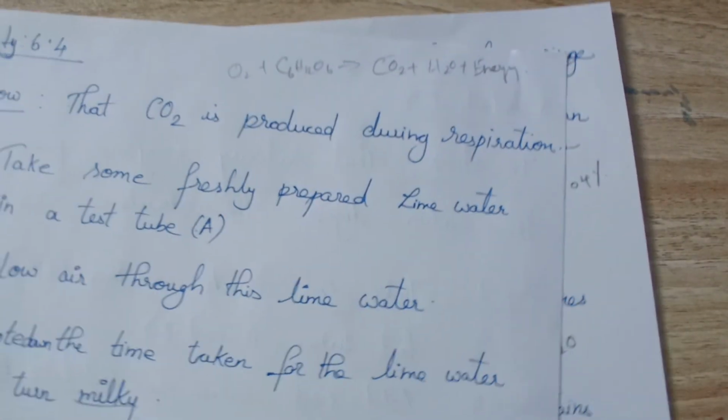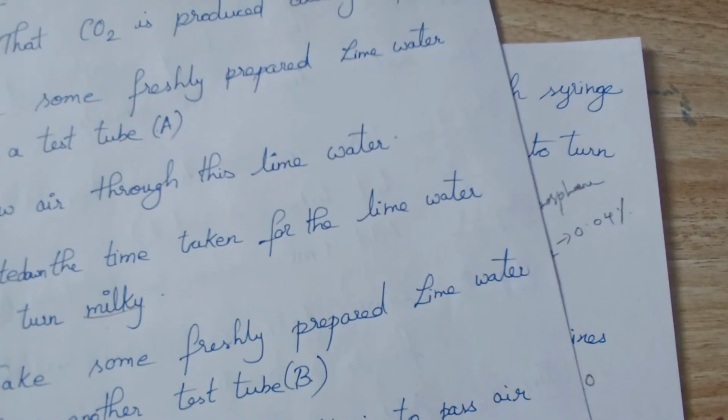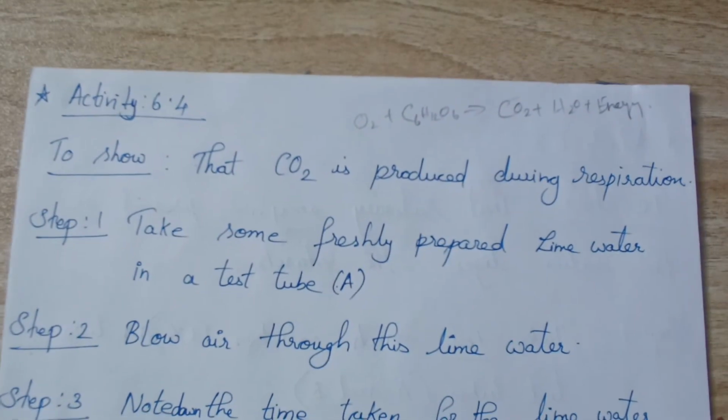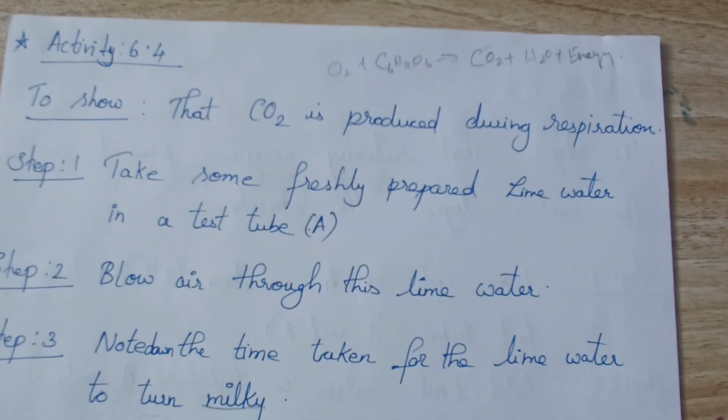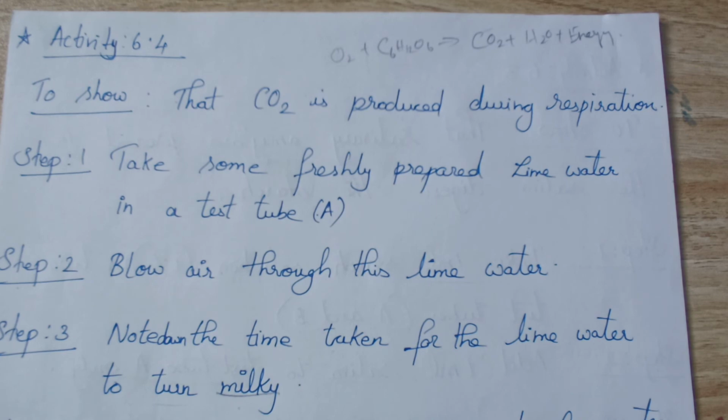So what is our aim? Our aim is to prove that CO2 is produced during respiration. How are you going to prove that? You pass the CO2 formed during respiration into lime water. When the CO2 reacts with the lime water, it forms calcium carbonate, that is, it turns milky white.